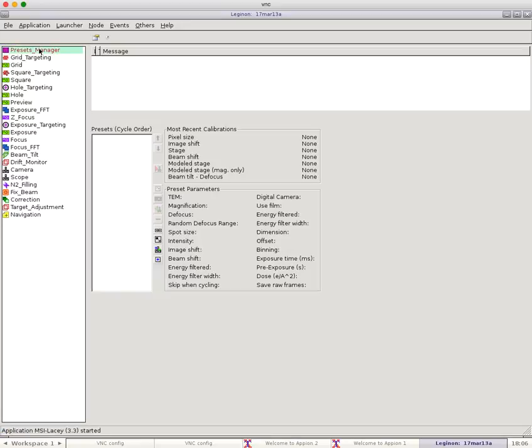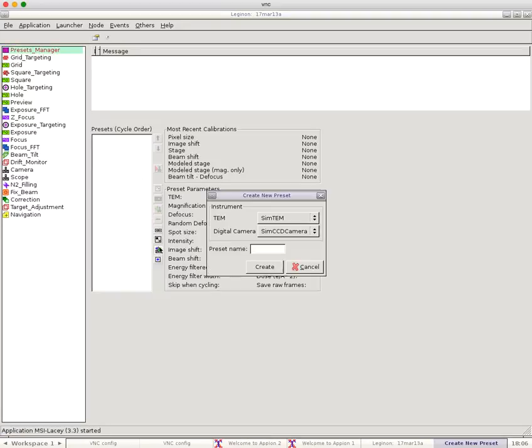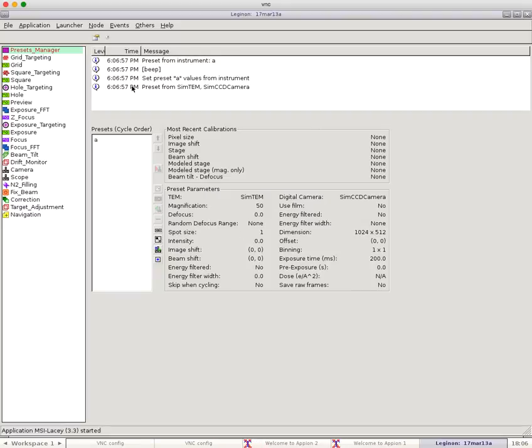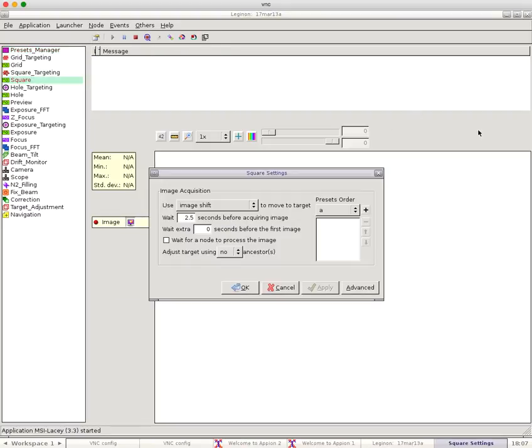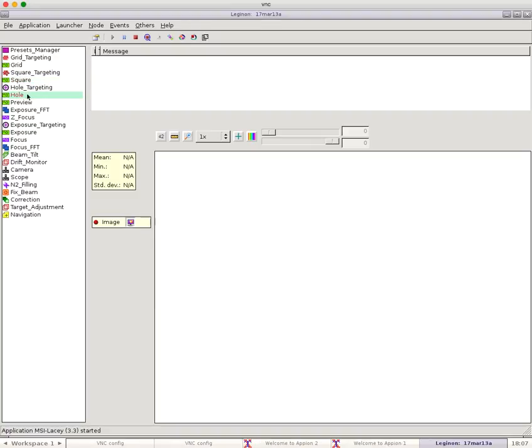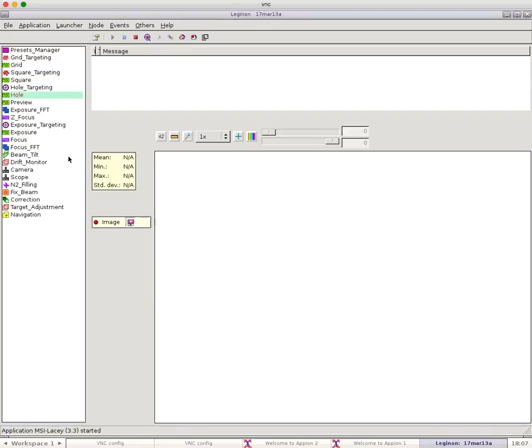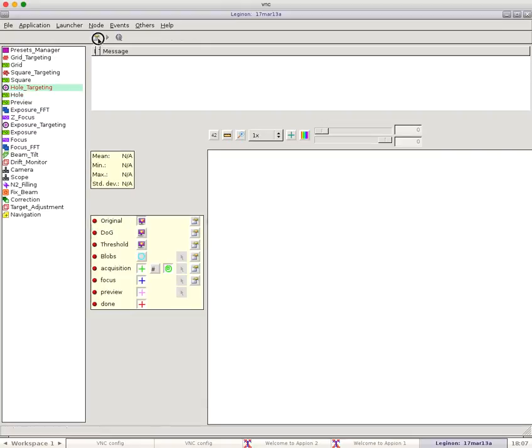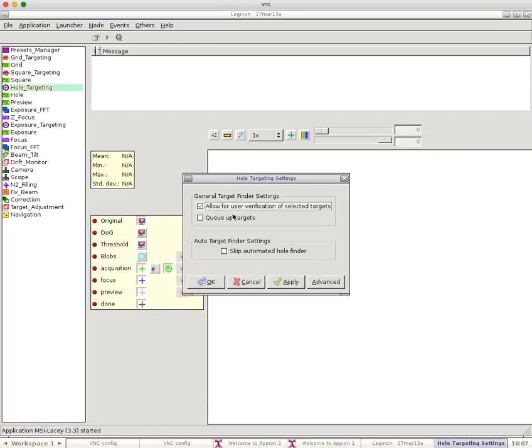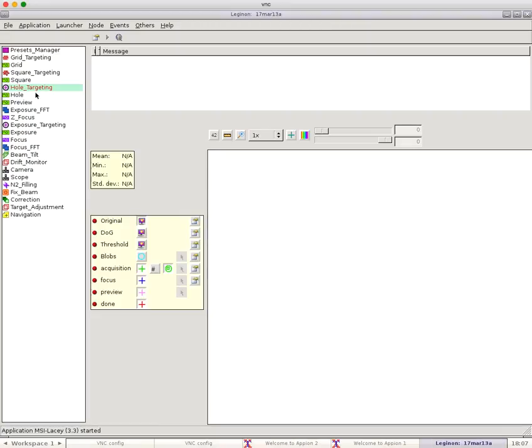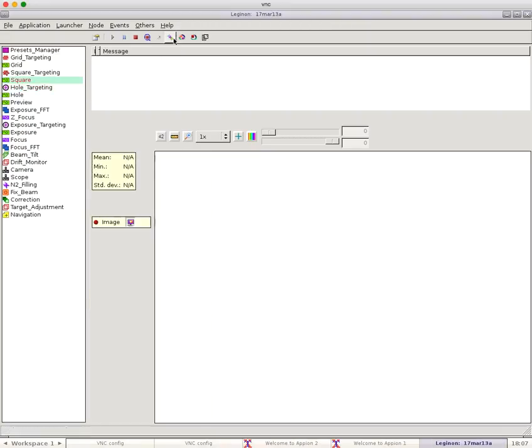Just to kind of get this quickly going, I'm going to create a kind of dummy preset. So I'm going to get a lot of errors associated with it. But I'm going to tell Square to collect on preset A. And then I'm going to tell Hole to collect on preset A. And then I'm going to go to Hole Targeting and tell it to allow us to verify what is Pixar. And then we can simulate a square.